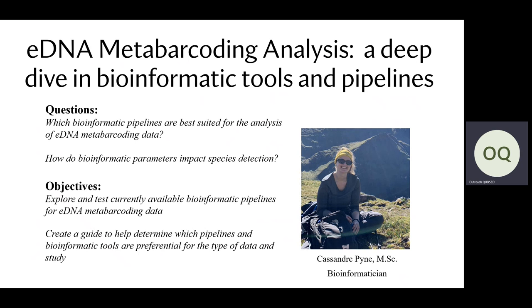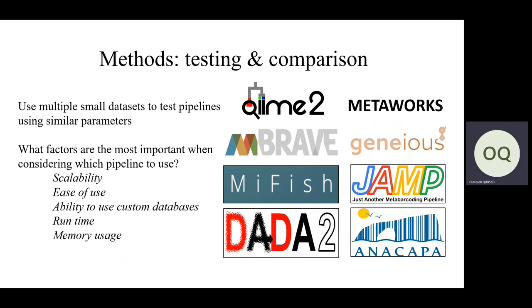One of the challenges when we're doing eDNA metabarcoding is that there are a whole lot of different bioinformatic pipelines people have developed. You take all of these millions of sequence reads and you've got to filter out chimeras, trim primers, denoise and deduplicate the sequences, and then match them to reference databases. It's kind of bewildering because there are a bunch of these different pipelines that people have used in the literature. And students in my lab were kind of starting to use them willy-nilly.